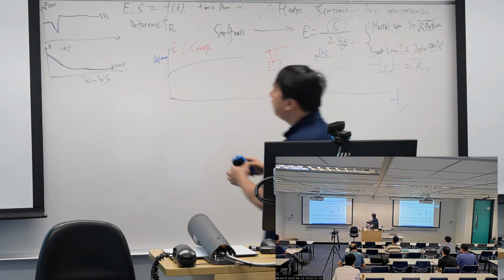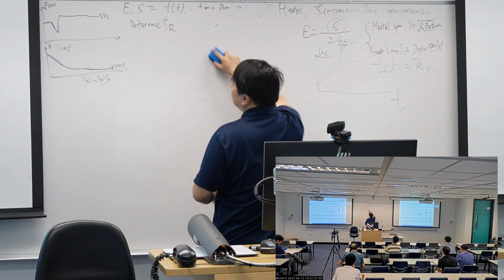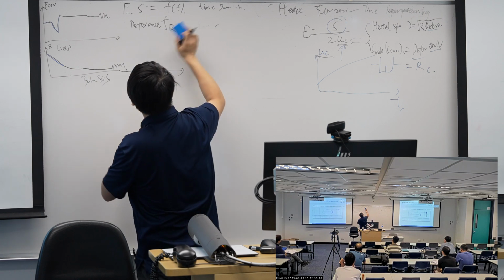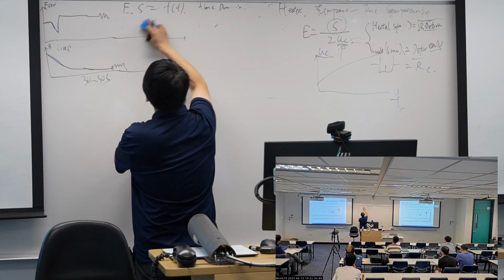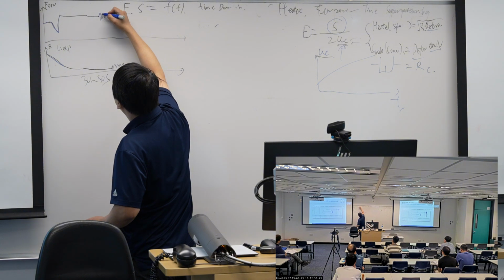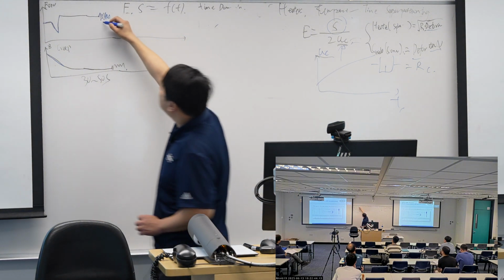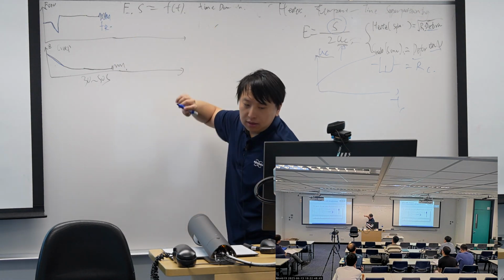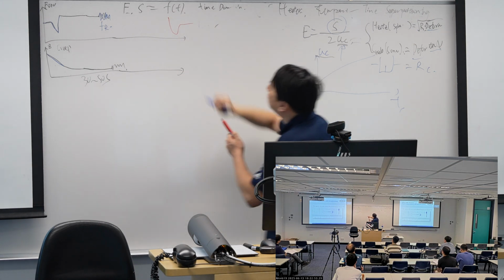So the idea is, for example, this is our time. We give a reference frequency at the beginning, and we put it again at the end of the force curve.